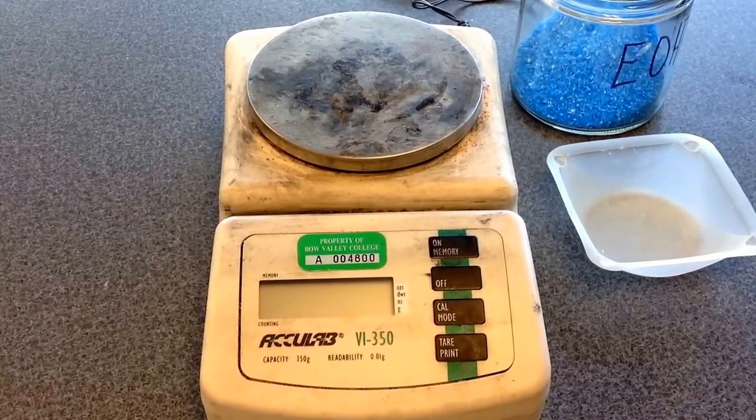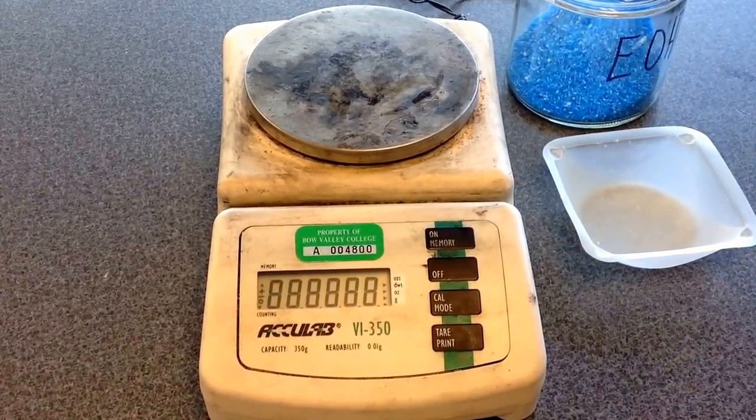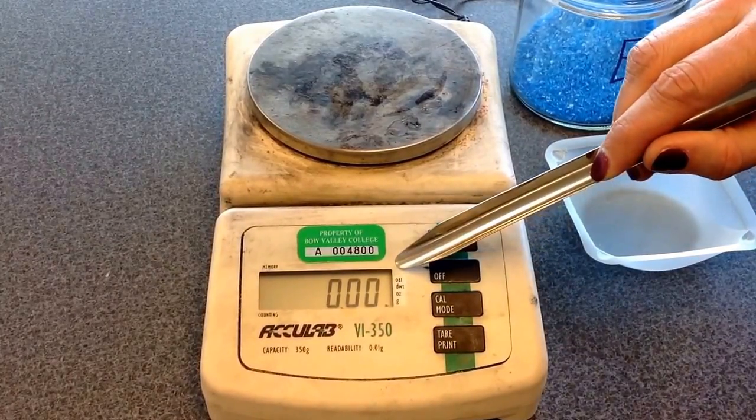Let's review how to properly weigh a mass using a scale. Step one is we're going to turn the scale on, give it a second, and then you'll hear a beep, and then you should see three digits appear.